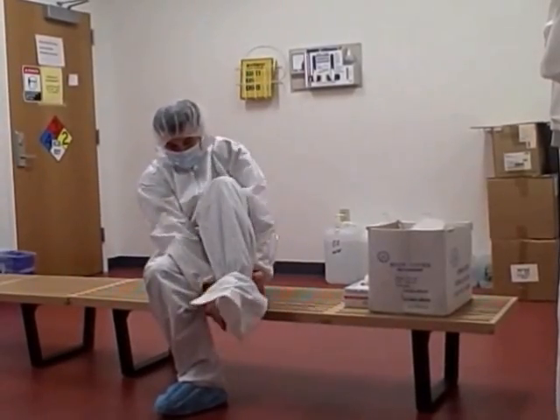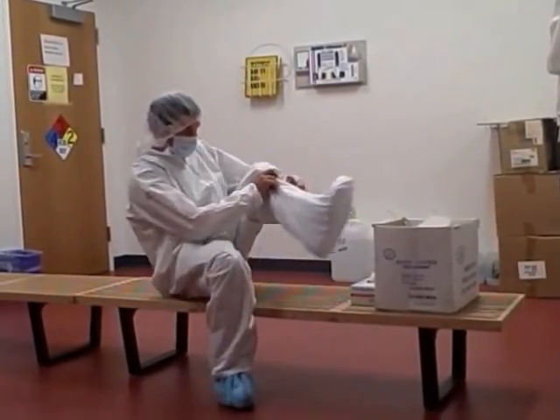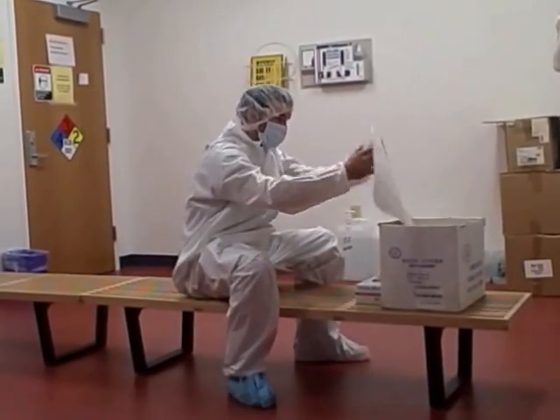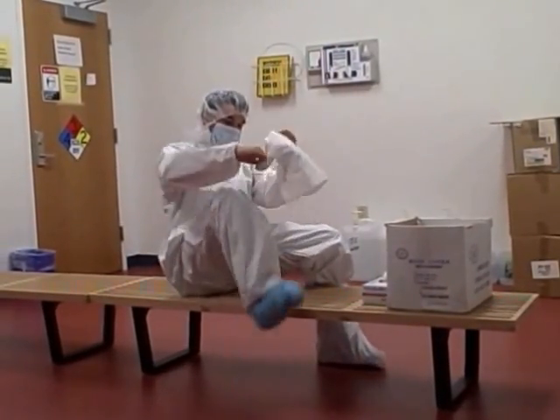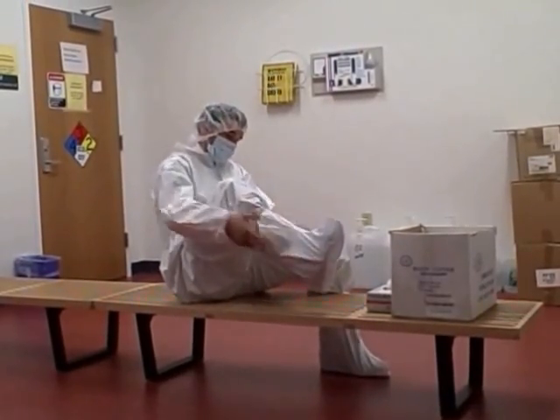Raise one leg up and put on the overboot. Swing the overbooted leg over the bench and place it on the other side. The soles of the overboots should only touch the clean room side of the bench. Put on the second overboot and make sure the overboots are covering the legs of the suit.